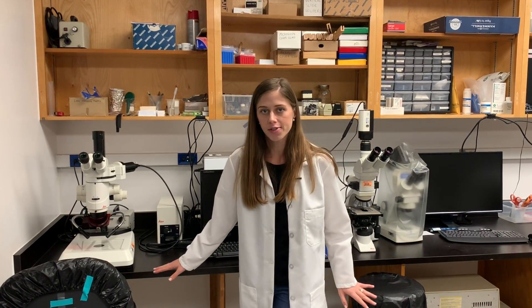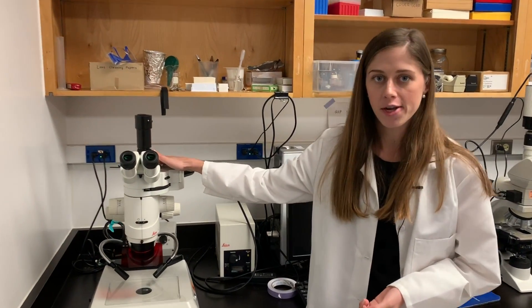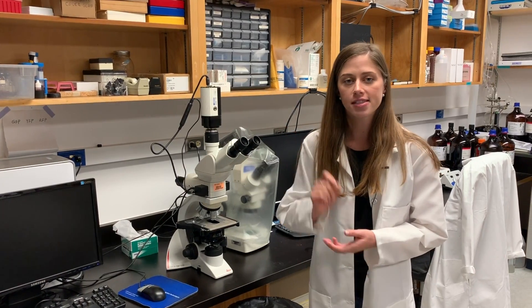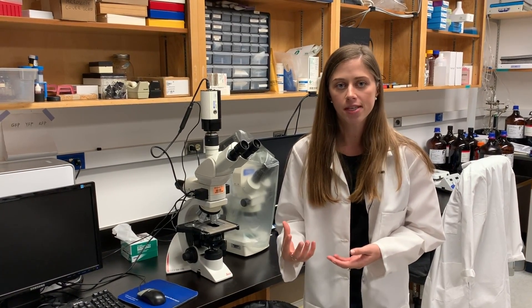In this room we have a bunch of different microscopes that we use to visualize the small surfaces that we work on. Here is a dissecting microscope and here is a confocal light microscope. Both of these microscopes have the ability to excite different particles and produce a glow, which is something characteristic of different proteins that we study.